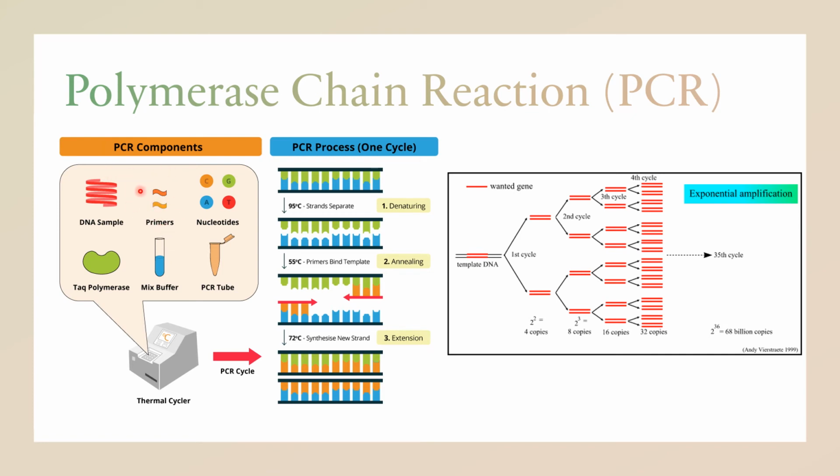What is a primer? A primer is a 9-mer, it means 9 nucleotides of DNA, on a forward and a reverse, that are going to specify where you want to amplify a specific region within your genomic DNA. So if you have your sample here, your genomic DNA, then the primer will actually bind where they complement each other, and then it will specify a certain area within the genomic DNA that you want to amplify.